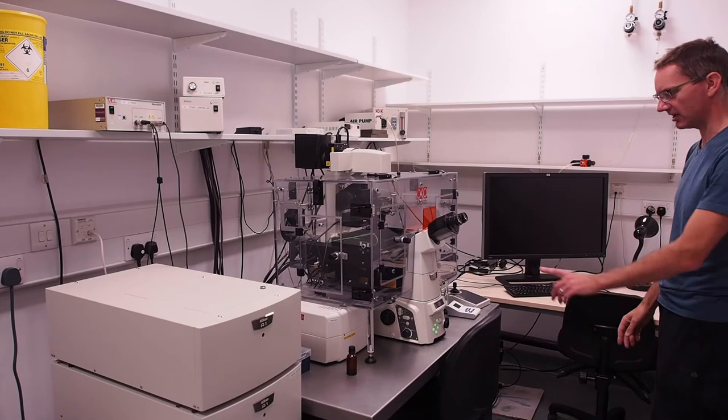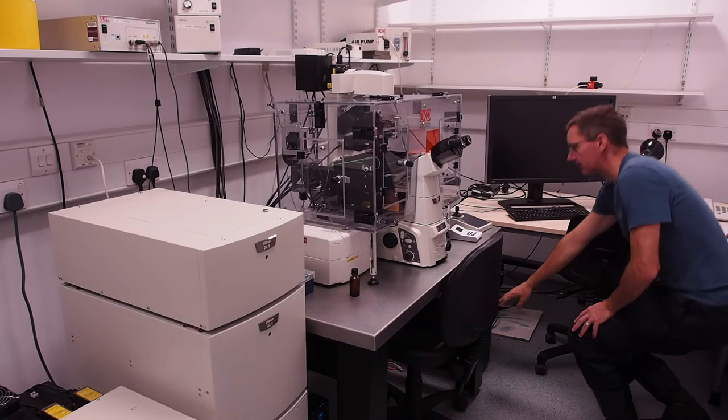Whilst the microscope is booting switch on the PC which is located to the right of the microscope table using the power button on the top left of the front panel.